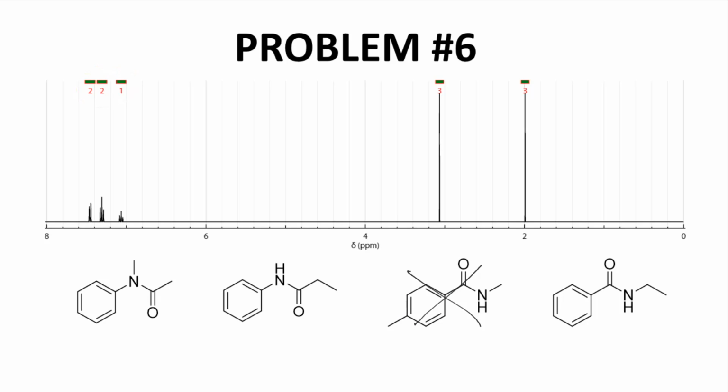And as we go to our last structure, we again have a monosubstituted benzene ring. This is a valid candidate. So we've only eliminated one structure. Now I love looking at methyl groups. So here we are. This structure looks like it has 2 3s in it, two methyl singlets. So let's see which of the remaining compounds actually have 2 methyl groups in there, 2 methyl singlets.